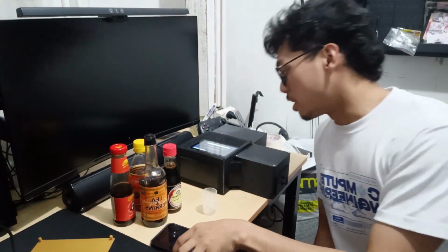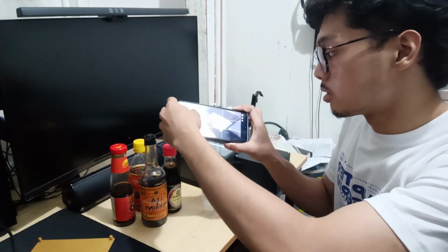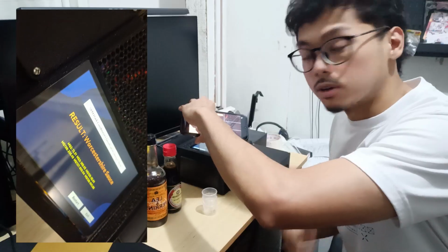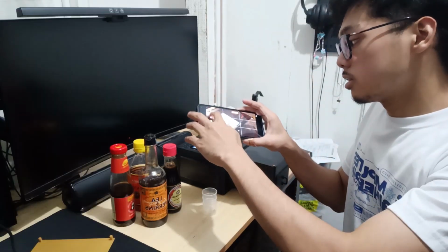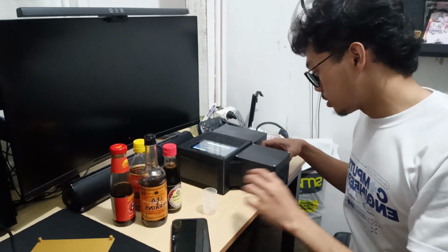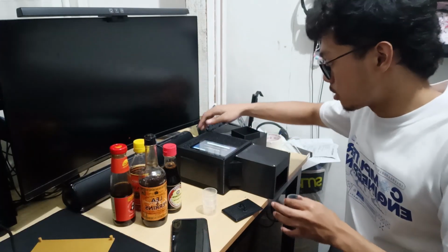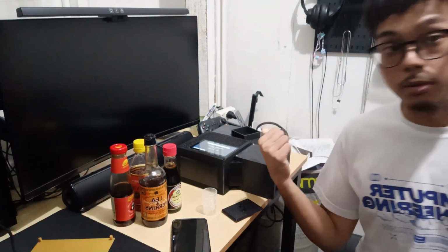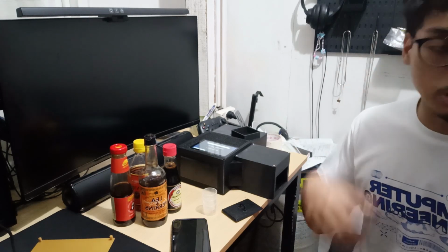Okay, so it's done. And it correctly classified the Worcestershire sauce. So now we go next to the fish sauce. Just gonna bring this out and then exhaust. Let's wait for it to come back to normal, guys. Just everything rinse and repeat.